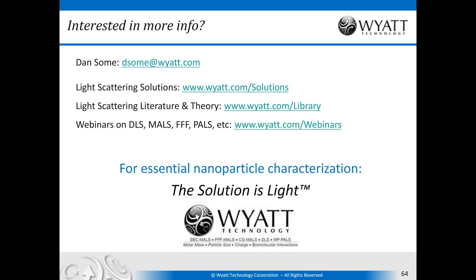Why is there a large difference between the expected molecular weight of a protein and the value measured by light scattering? There are a few possibilities. One is that the protein is in a different oligomeric state than you expected. If the expected molecular weight corresponds to that of a monomer, it's possible that it is actually oligomeric in solution, and light scattering will measure that oligomeric state in solution.